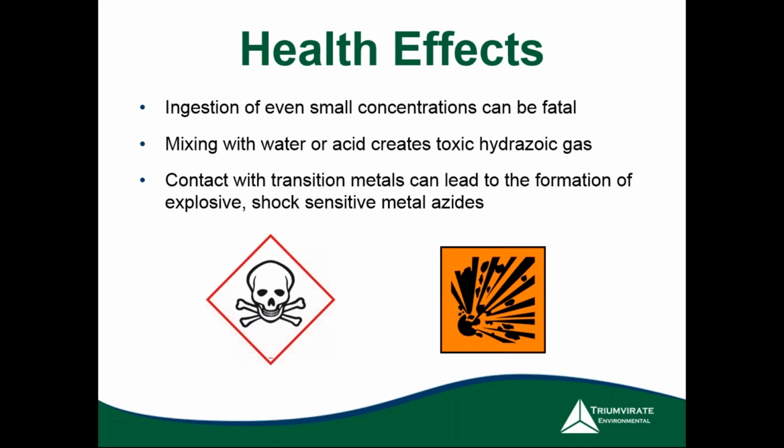Another thing to note is that mixing with water or acid creates toxic hydrazoic gas. If you mix it with just water, the hydrazoic acid and gas concentration is actually very low, probably not even enough to cause any of these symptoms, maybe weakly. But if you were to mix it with a strong acid, like sulfuric, the reaction would be much more violent, and you would see this hydrazoic gas. Also, contact with transition metals can lead to the formation of explosive and shock-sensitive metal azides, and that's what I had alluded to with the laboratory waste piping. That's where that danger comes in.